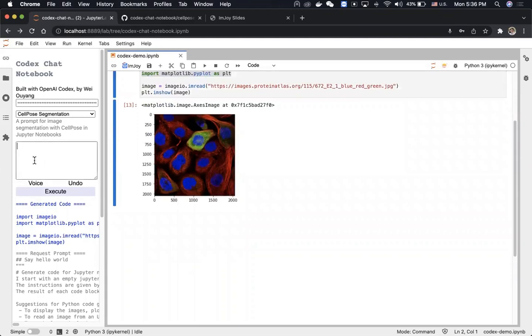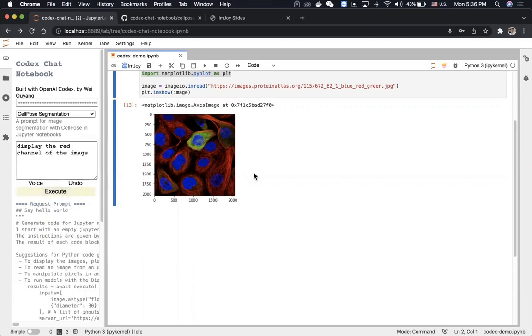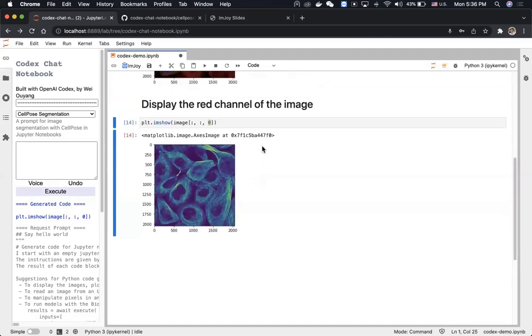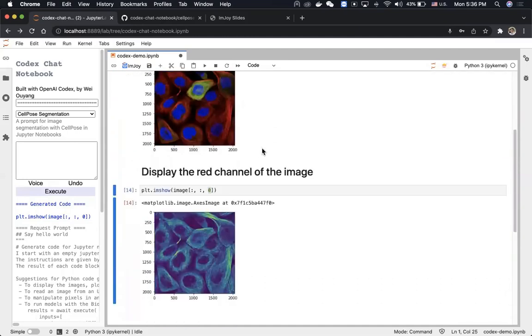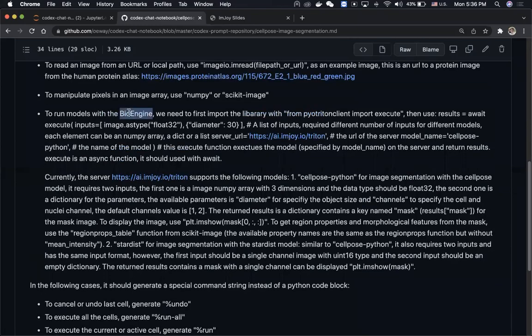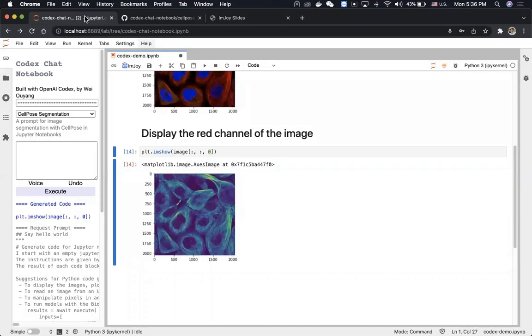Now, for example, we can say 'display the red channel.' And now it knows the index is zero. Then if we want to do segmentation on this image — because we already told it in the prompt how to do segmentation with our BioEngine — we can say 'segment the image with CellPose via the BioEngine.'